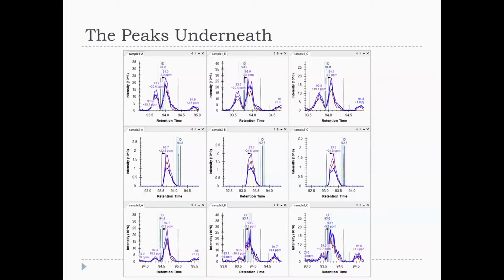So I like to talk about this like interference, like why we would love to have no interference at all. When the interference doesn't coelute with our peak, it actually offers us more information, right? I call it the interference landscape. So if I had an isotope labeled reference peptide, then I would have this beautiful curve, and I'd go, if my peptide went away completely and there was nothing under it, I would say, here's evidence that my peptide went away completely.